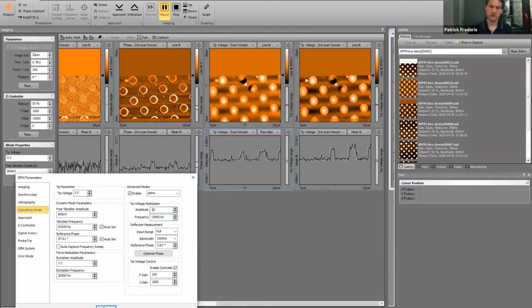You can try to get it better quantitative. You can try to work in a glove box to get rid of the oxygen and to get a much lower humidity. And then you need somehow to characterize your tip first. A suitable material for that would be HOPG, freshly cleaved, and then make a contact potential difference measurement on that sample.